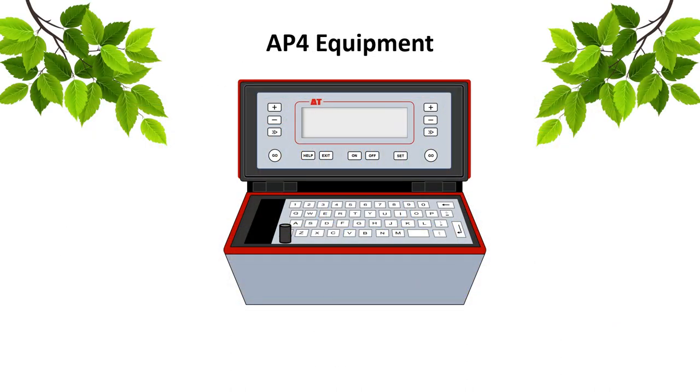The AP4 porometer consists of two main parts: the body with readout screen, mirrored command buttons for left and right-handed users.